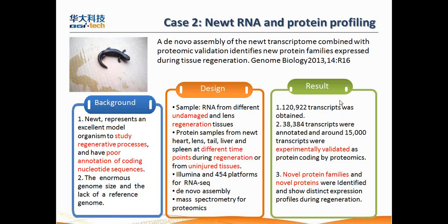So as a result, they got this number of transcripts for the Newt. And by aligning all these transcripts to some known database, they can annotate this number of transcripts.